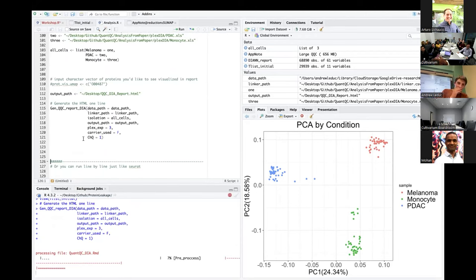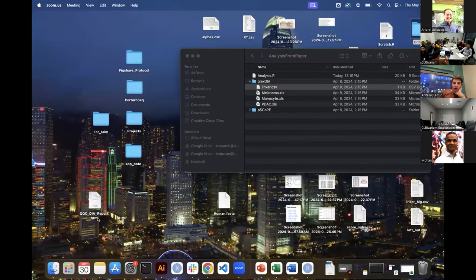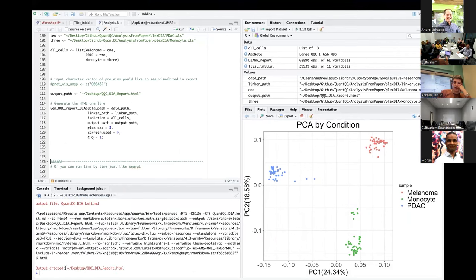So it's going to read in information. Has anyone worked with R Markdown? There's a knit button, and it just takes everything and throws it into a PDF. So it's nothing very fancy. There's just a markdown buried in one of the GitHub files, and it'll take stuff and run through, and it takes a couple seconds to go. But at the end, you get this report.html, which I printed to my desktop, and now I have it here. Let it go to convince you that it won't crash. Okay. Cool. It's doing its stuff. Okay. Output. Cool. It's there.